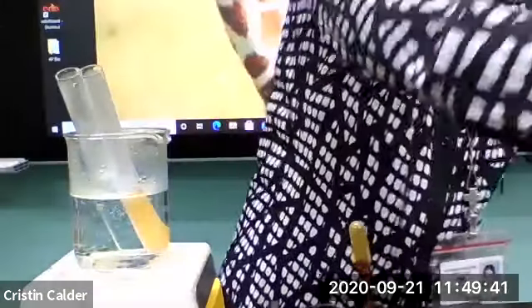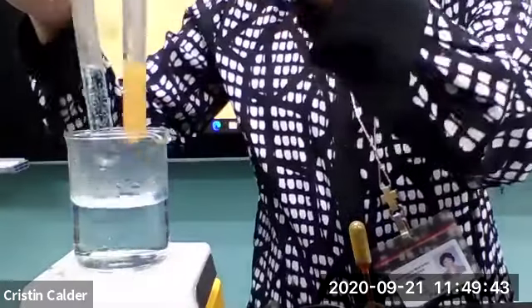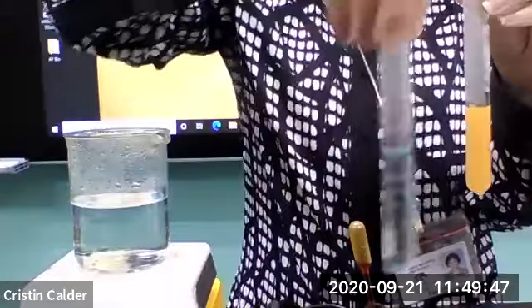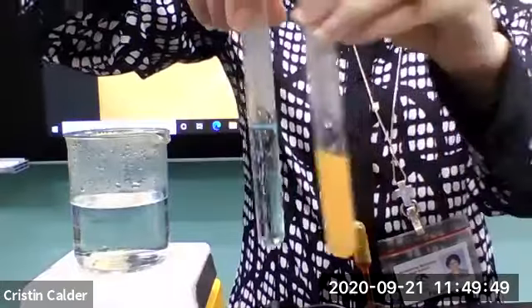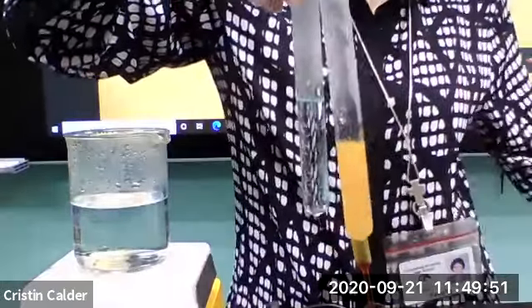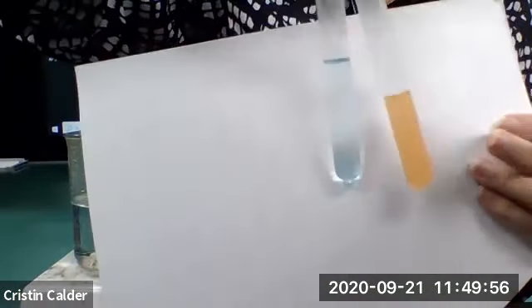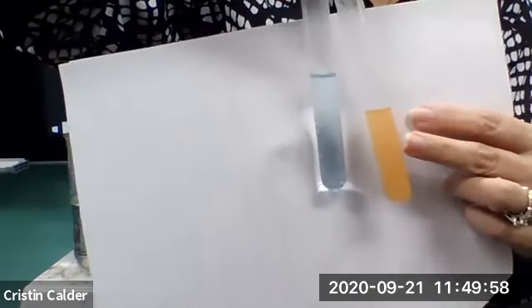And let's go back now, because my Benedict's has had enough time to heat. Okay, so this is my water here. You see how it's still clear blue. This is my positive test for glucose, and you see how the standard, which actually has sugar in it, turns a yellow.